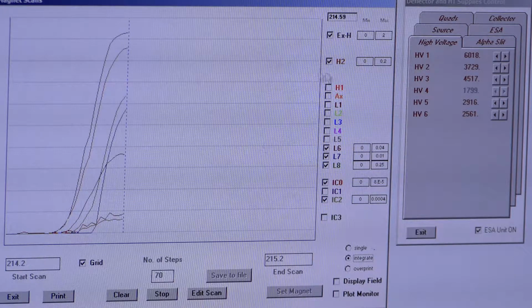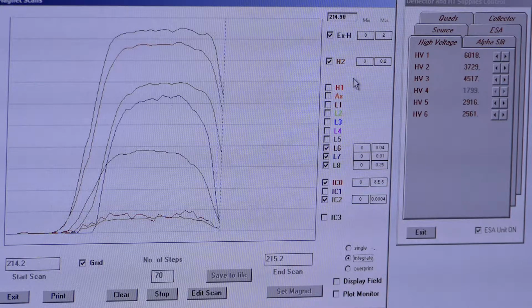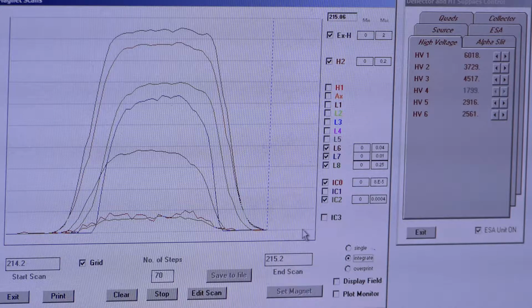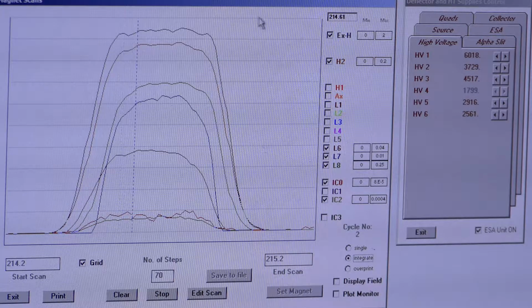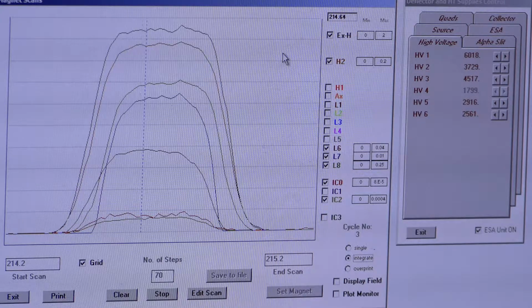you would see your first one, which would be the only single scan. And then as it came around and passed over it again, you'll see the cycle number 2. So it's going to be the average of these 2 passes. And you could keep going to 100 passes. But we usually stop at about 4 to see general peak shape without noise. So we'll give it a couple more passes to see how it actually looks.